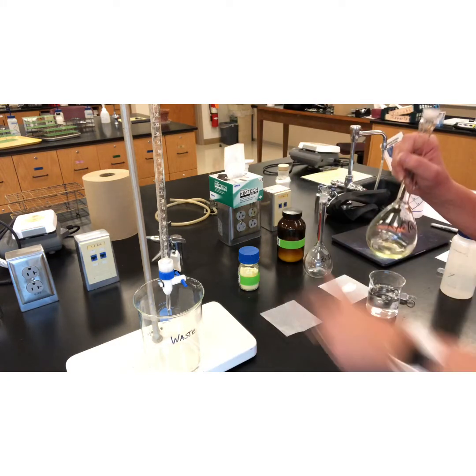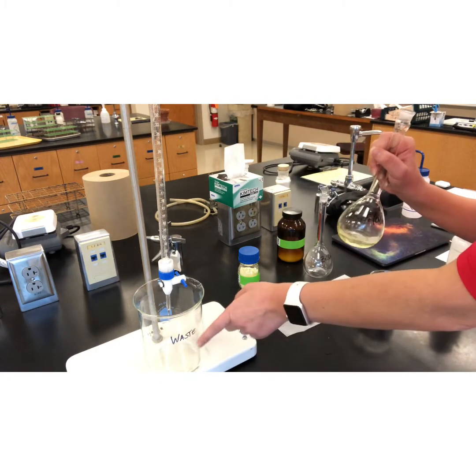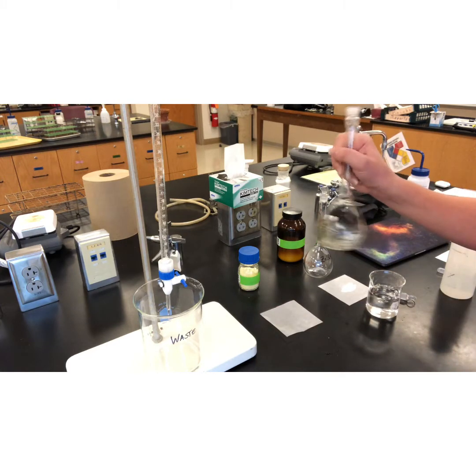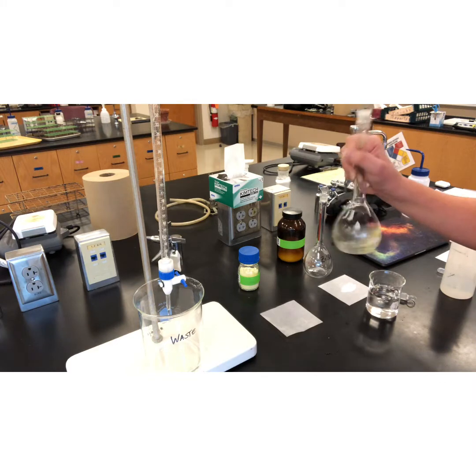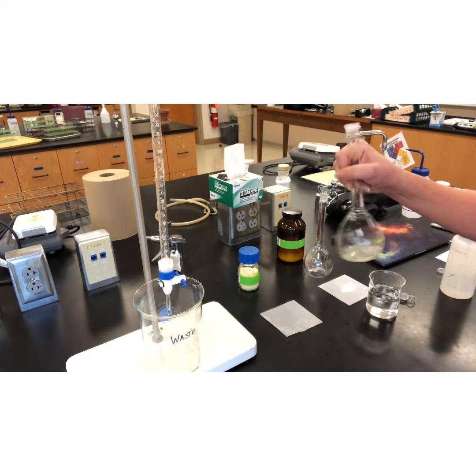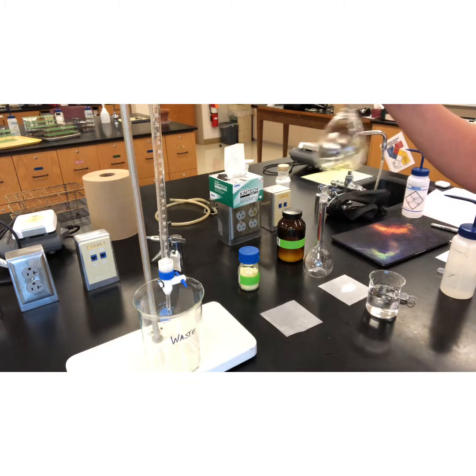I've got my burette set up for the next couple of steps, and I've labeled my waste container so I don't have to keep going back and forth each time to the waste container. I'm just going to put it all in there and then take it to the hood at the end of the lab and properly dispose of my waste.